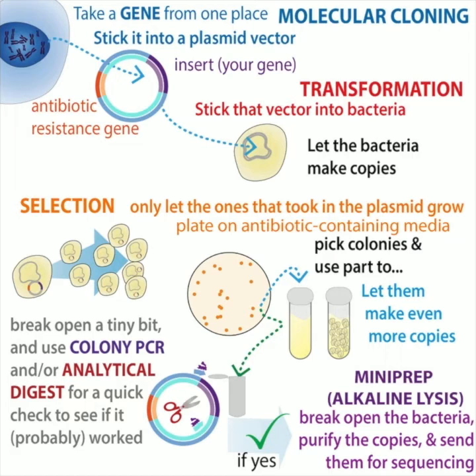So say your protein is not expressing. What you want to do, there are a few things. First, you want to make sure that the cloning is all good. When you're doing the cloning step, typically you start out in cells that don't have T7 polymerase. So these are not expression cells. These are just cloning cells that you can use to make lots of copies of the plasmid.